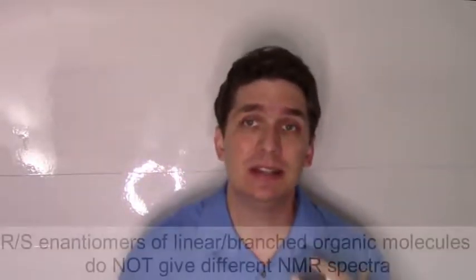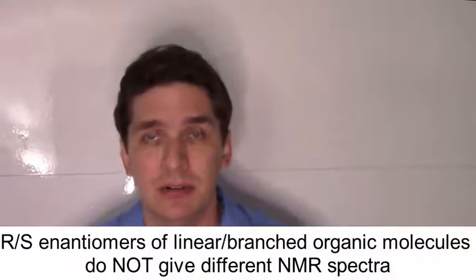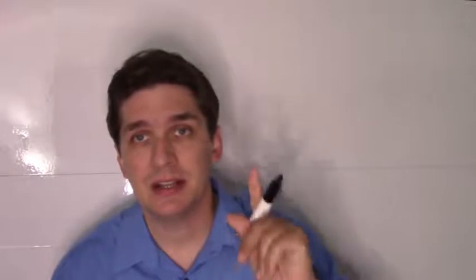Well, one of the big things I found at first was that if you have a single chiral center, particularly a molecule that's a branched linear alkane, it does not actually show any differences under NMR. So no, using just straight NMR as a traditional technique, you cannot use NMR to resolve R and S centers if it has a single chiral center and it's a branched or linear alkane.